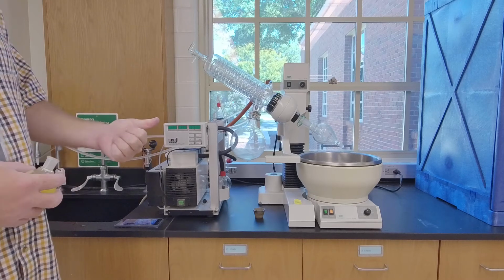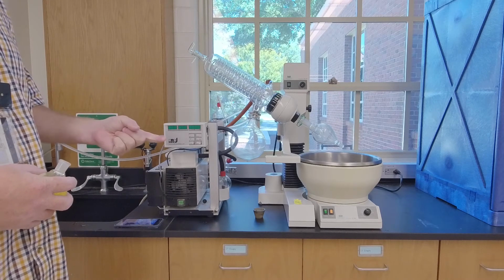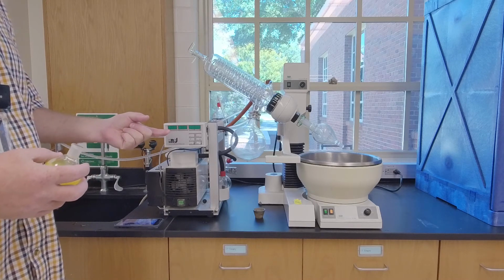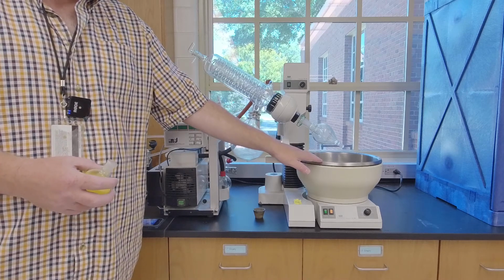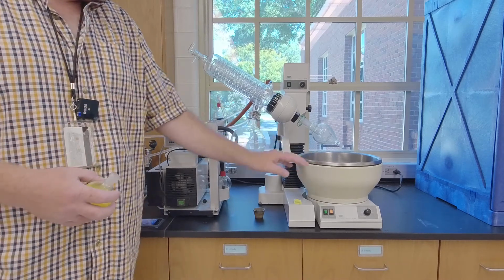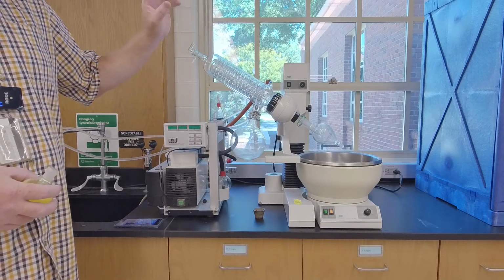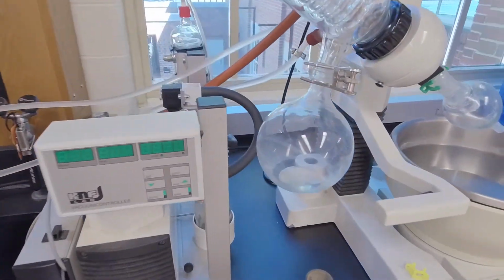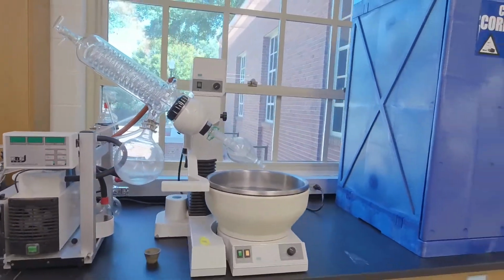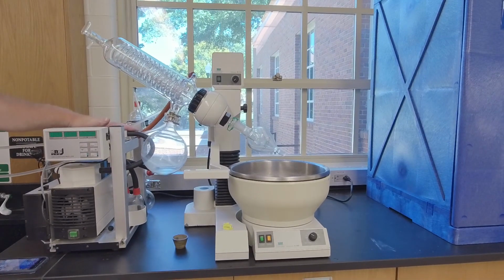All right, so lower the boiling point of the solvent by vacuum, spin the solution to increase the surface area of the solvent, and supply a little bit of heat to replace that loss due to evaporation or to get it up to the boiling point. And then make sure you've got a condenser that can condense the vapor so you can collect, right? We collected our ethyl acetate there. Hopefully you can see that. You can recycle that or you can dispose of it in the organic waste, but most importantly, it didn't get into our vacuum source. All right, that's the rotovap.